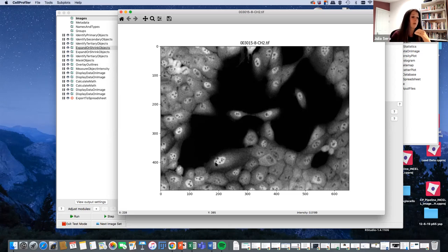If we have focused our microscope on the nucleus, then that's fine. We're going to be getting a nice slice right through the center of the nucleus for this cell and probably for these cells also. But what's going to happen at those bottom regions of our hillside? The focal plane is going to be here, but the thin parts of the cell are going to be down here, so not necessarily in the focal plane.